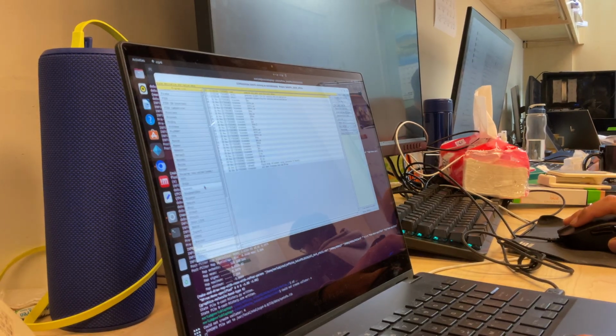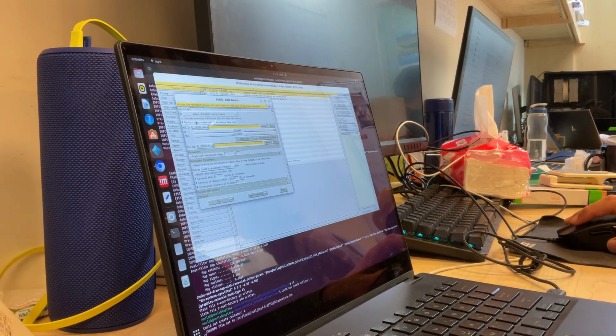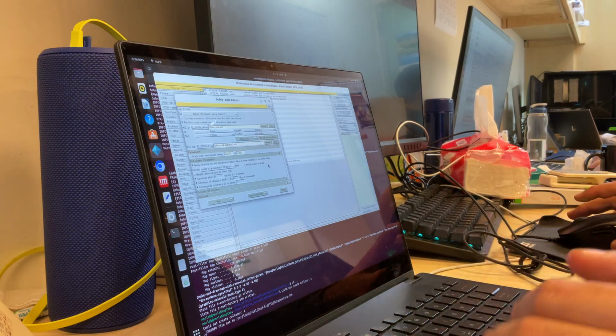Here, scale it. Okay? And so, scale refinement using Scale It. Do not include anomalous difference data. Perform cross comparison. Okay? And so we just take our 180 picosecond dark and see the FP is 180, F dark is the first, and the derivative is F180 picoseconds. It's going to try to scale the derivative to the dark one.